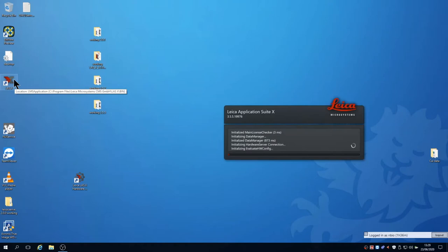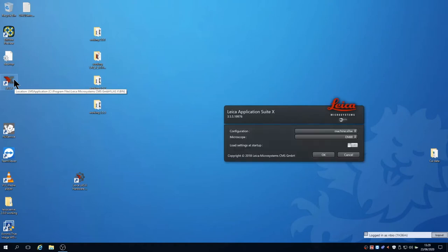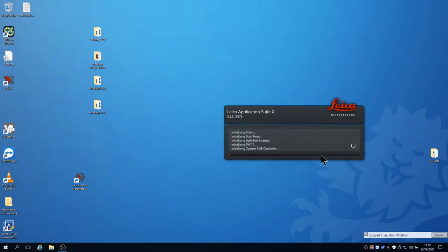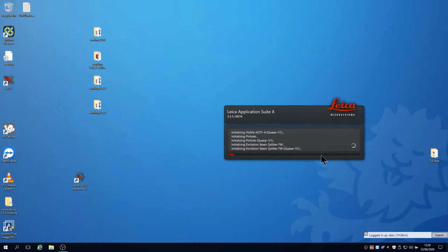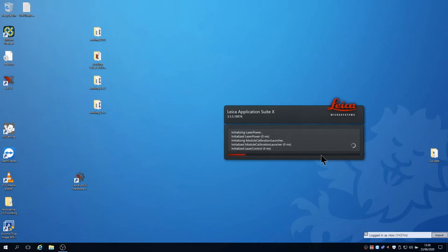Firstly double click the LASX icon on the desktop. This brings up a splash screen with options for configuration and microscope stand. These are already set so don't adjust them just click OK. Now wait for the system to boot. It checks connections with all the hardware and takes almost a minute.